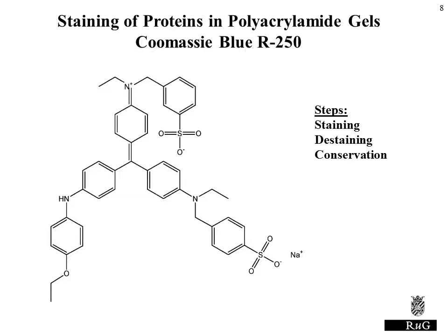When you're finished with your gel, and as you've seen in the little movie if you looked at the link, you'll see only the migrating dye. These are simply dyes added to your solution to show you how far electrophoresis has progressed. But you do not see the proteins. Proteins are not visible to the naked eye unless they are colored, like a few are, like hemoglobin. But most proteins only absorb UV light. So you have to stain them, or in other words, you have to make them visible in the gel.